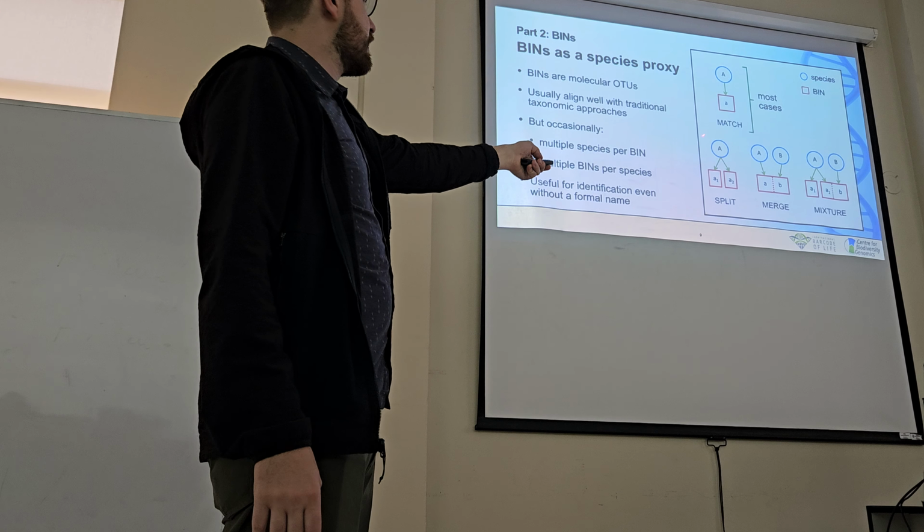And you can see here what the barcodes are. It's actually a lot of birds, insects, plants, right? So some people work on plants. Mammals, right? So pretty cool. And then you can see the individual records here. It just shows up to 1,000, but if you want, you can see the actual record.